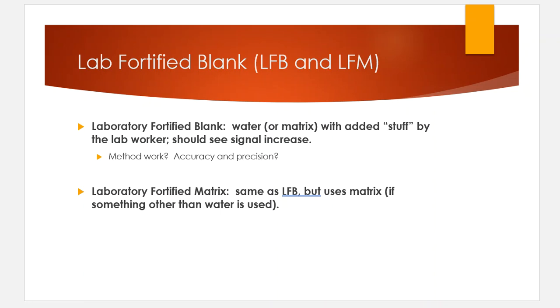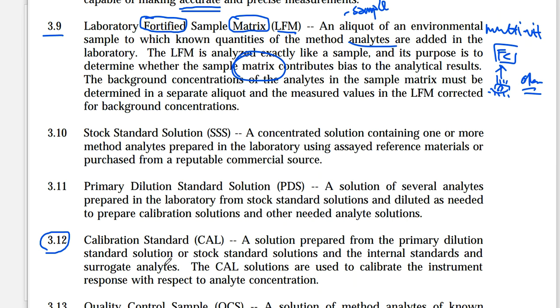All right, guys, in this video, we're going to continue on after the lab fortified blank, and the next definitions that we're going to hit are 310 and 311. 310 is a stock standard solution, and 311 is a primary dilution standard, also abbreviated as SSS and PDS.